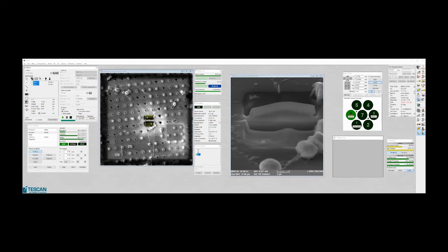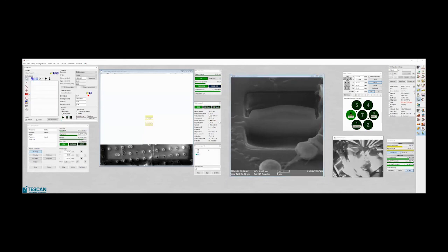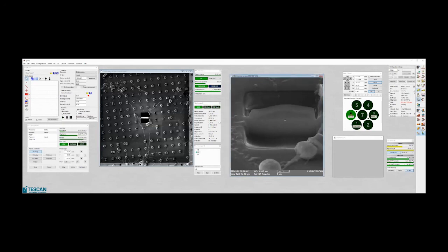Okay, I'll check it. Okay, it's enough. So we will move back to this more gentle one. So we already polished it. So now we use a simple trick that we will turn it to 0.